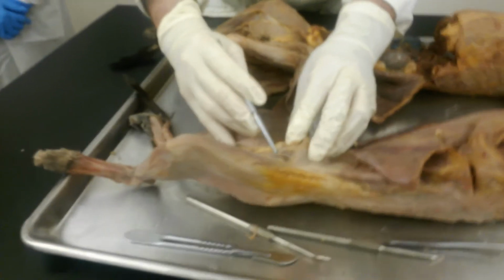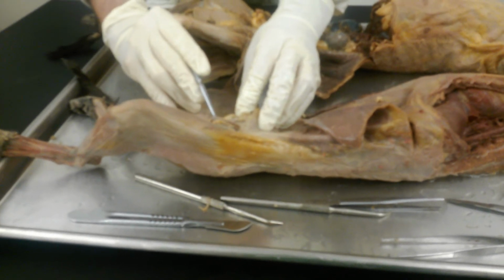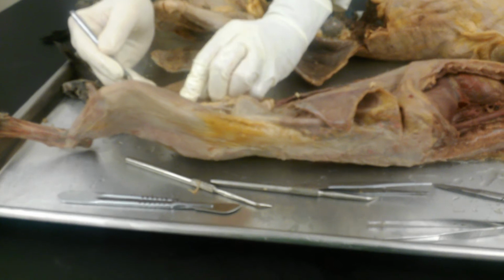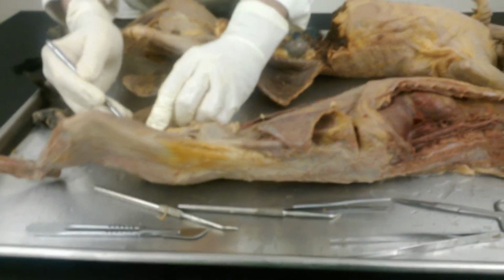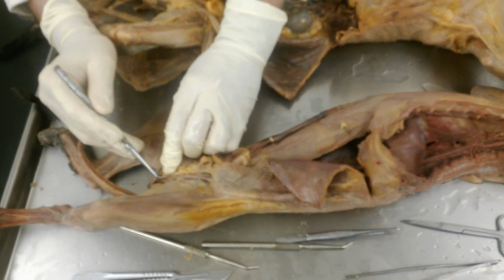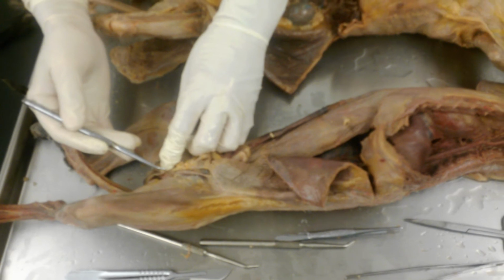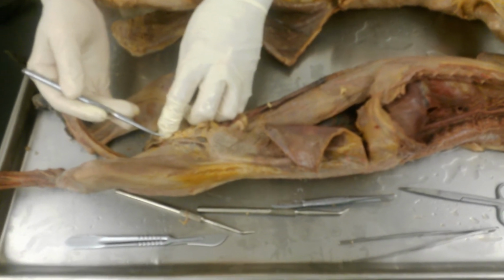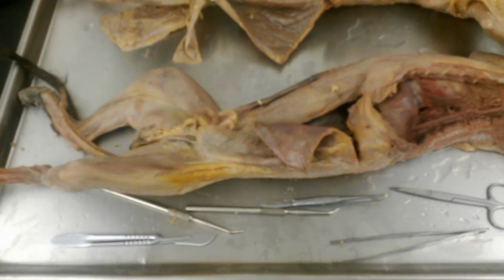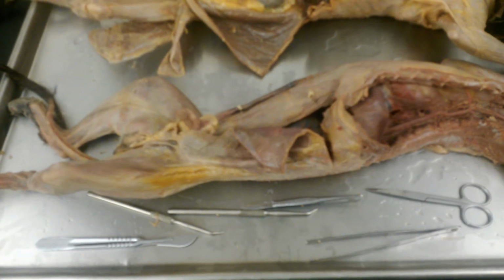You'll have to dissect them out of the fat as the spermatic cord. And the spermatic cord travels through the subcutaneous tissues all the way down. Here's one sac of the scrotum is opened so that you can see it joining to the testes there. The internal structures of the spermatic cord would be the ductus deferens, the pampiniform plexus. They're really going to be hard to see on your cat because it's so small. That's why we've got the surgical specimens down there. You should be able to identify those structures on the surgical specimen.